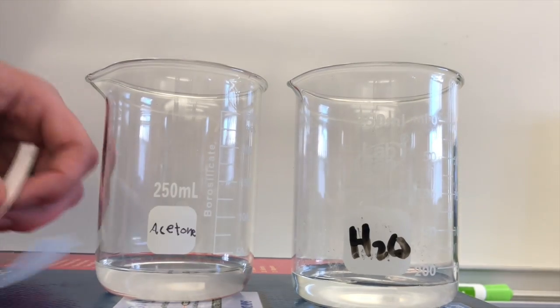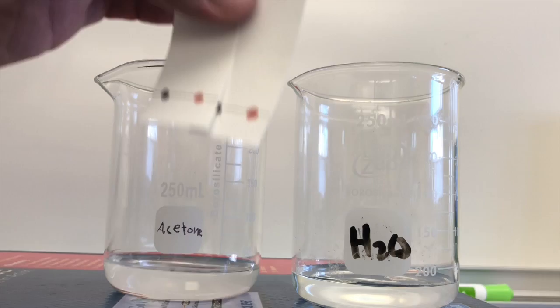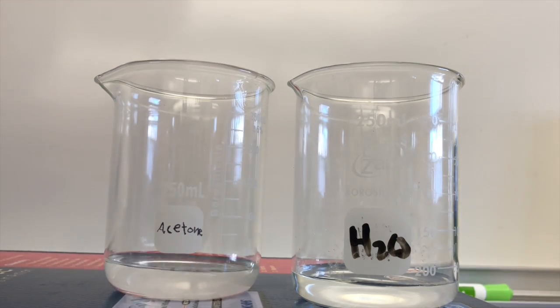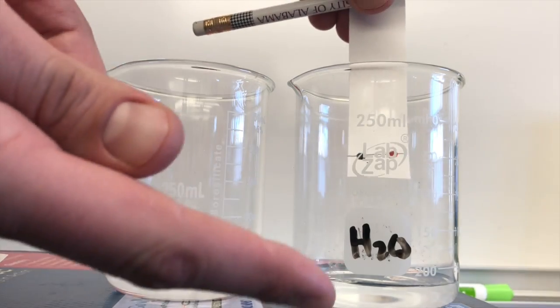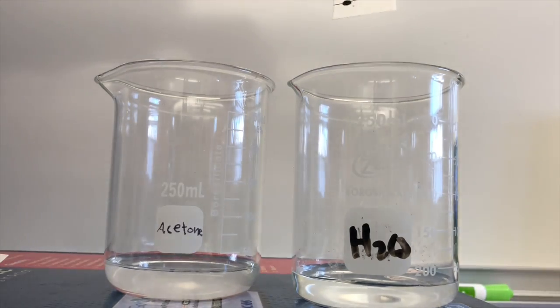This is gonna be our acetone so I've got these labeled now and I'm going to time-lapse it and put them in here, suspend them from a pencil and we will see as the liquid gets drawn up the paper how well it dissolves the two different types of markers.